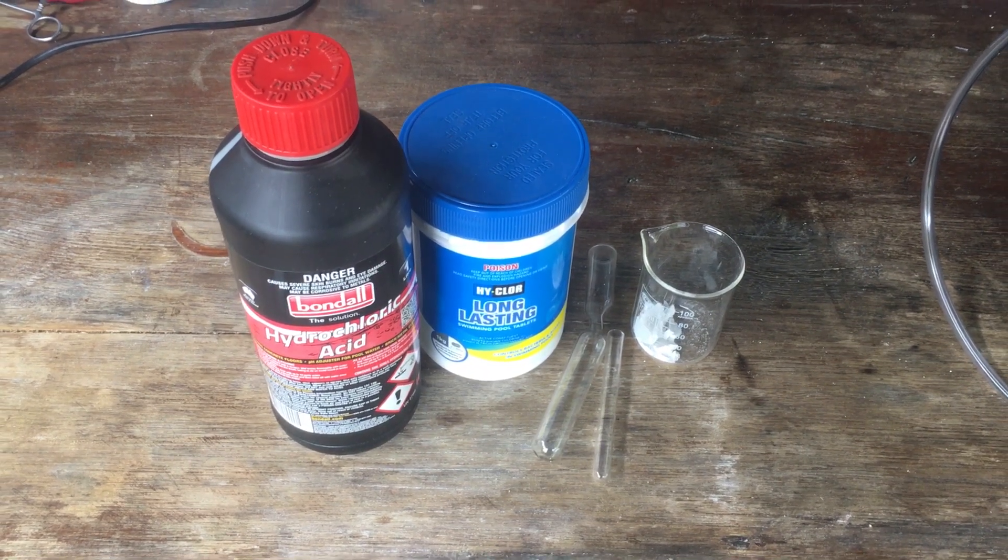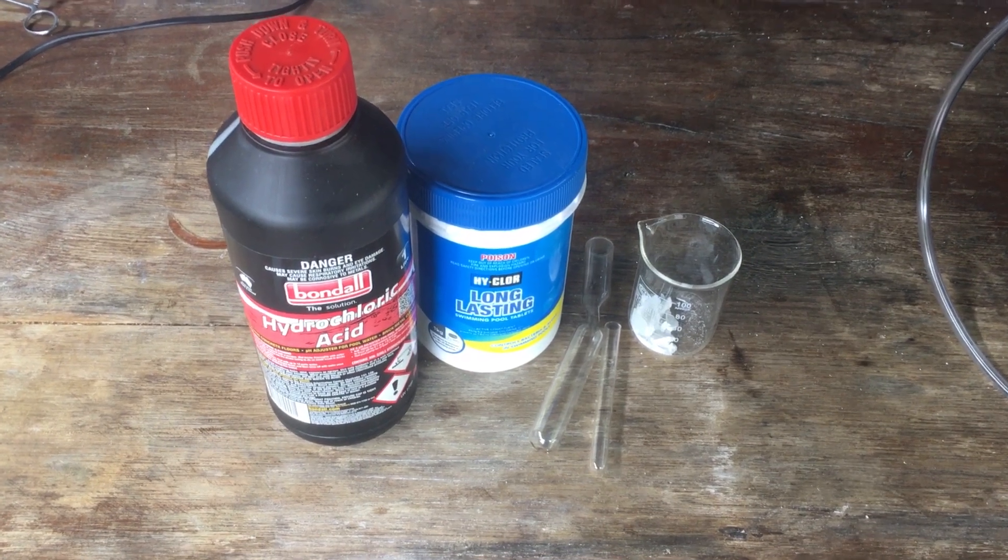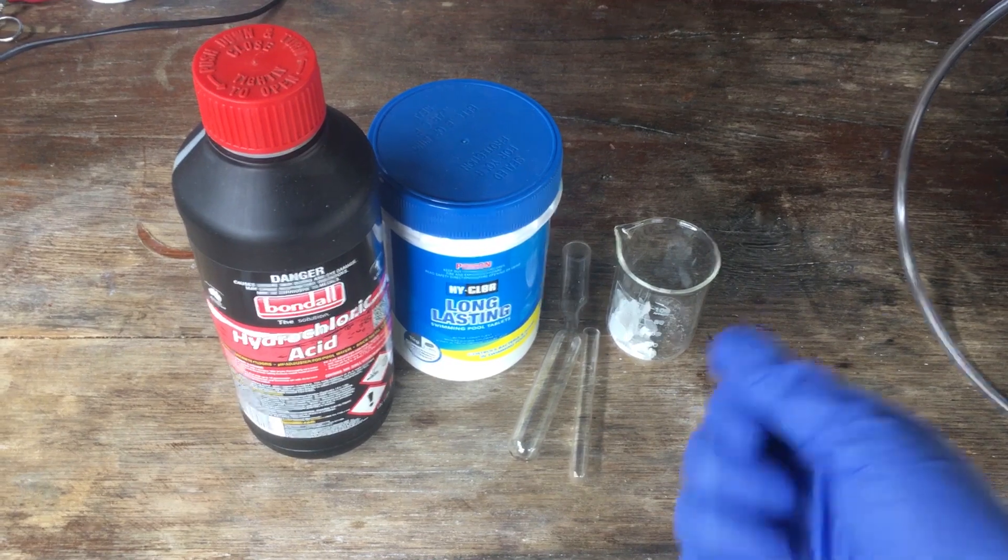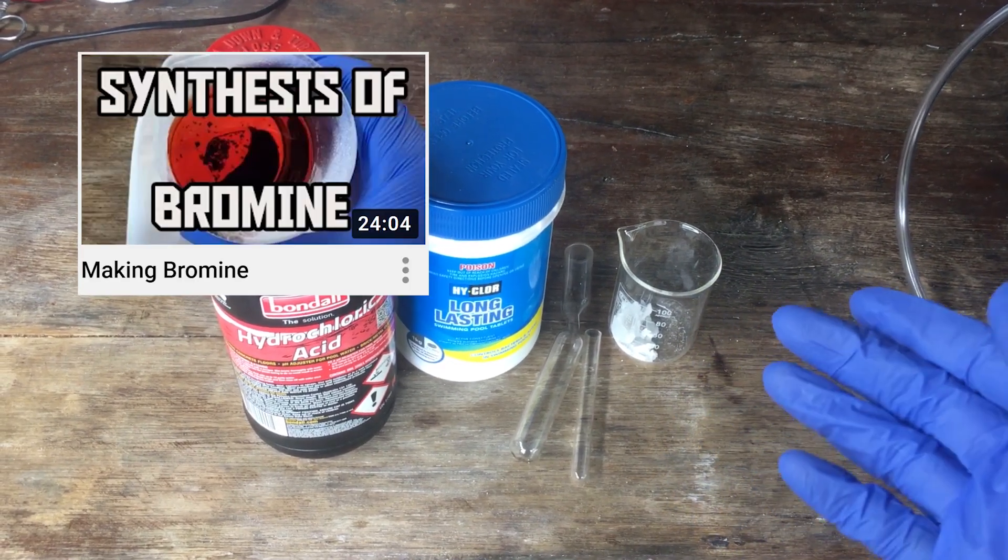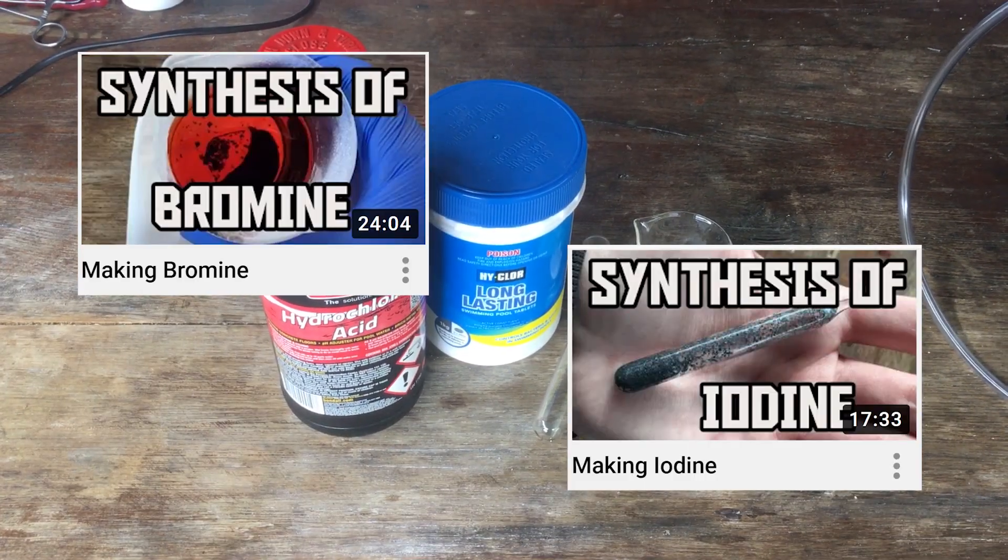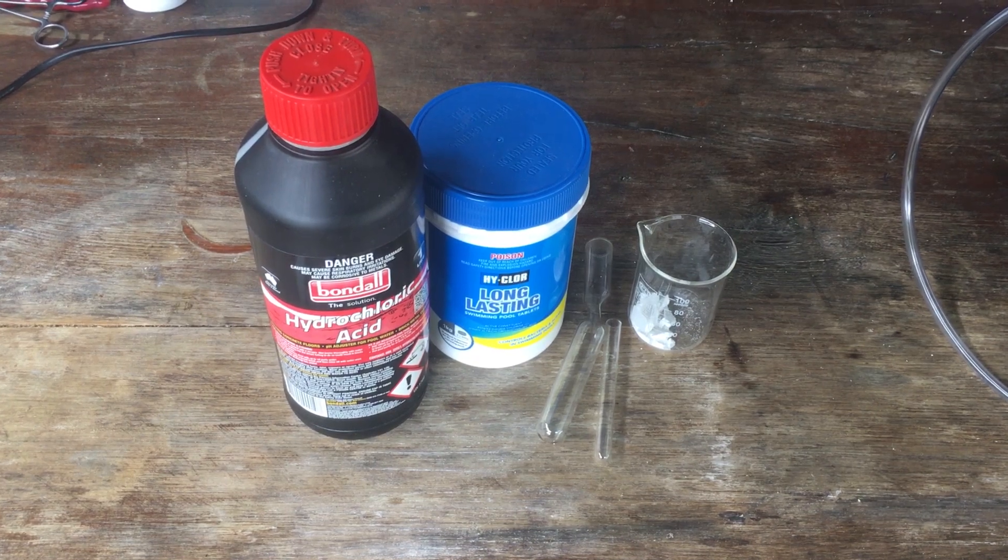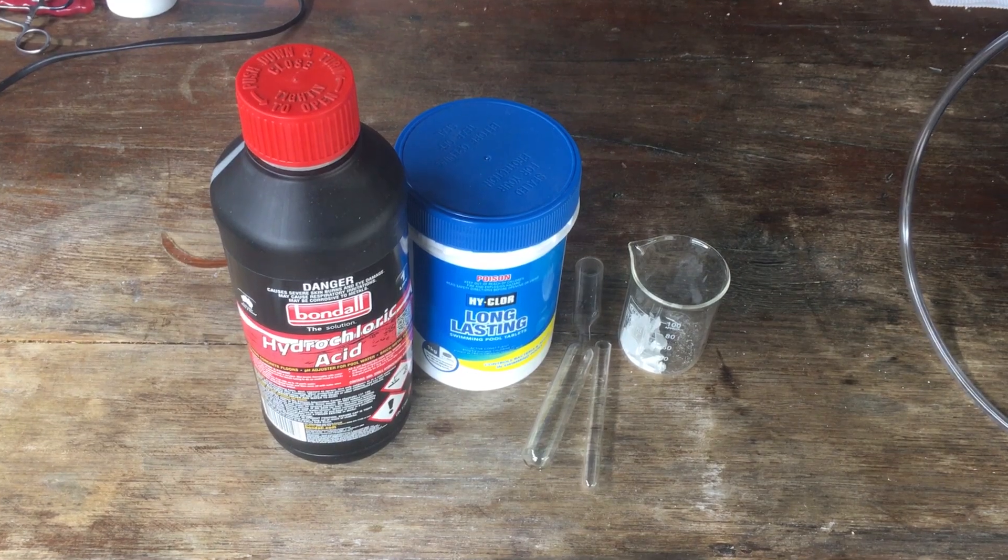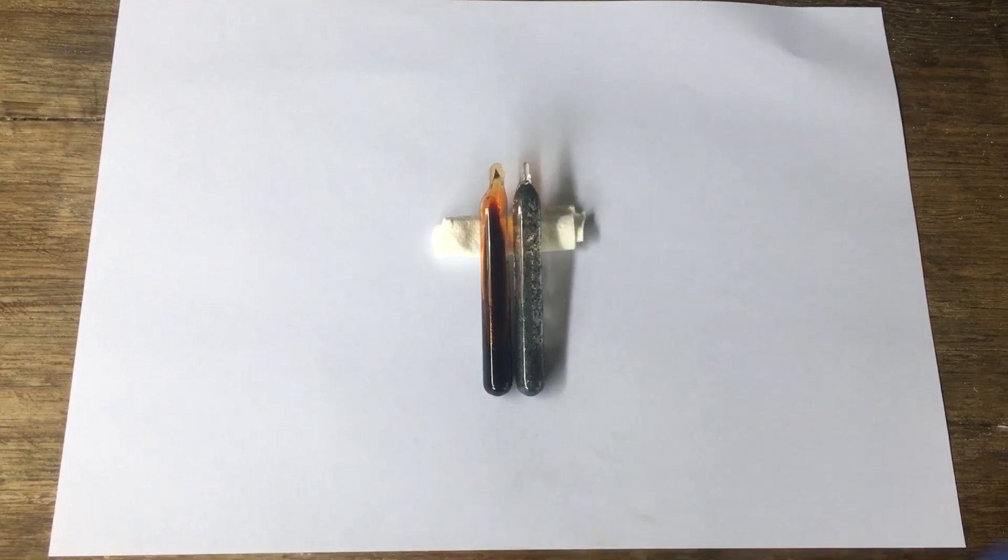Now you may remember quite a while ago on this channel we made a couple of videos making two halogens. One video for making bromine and one video for making iodine. And in each of those videos we put the respective halogen into its own little ampule. I'll grab those ampules out now. And here they are.